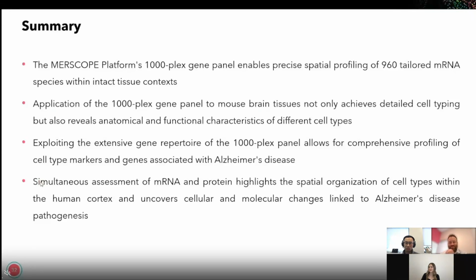Great, thanks, Peter. All right, next question. If you include cell bounds in all aux channels, what are you seeing the maximum runtime being with the 1000 plex? Yeah, so I can take that one as well. Maximum runtime, if we max out all of those settings, is approaching 65 hours. That's maximum tissue area, cell boundary stain in all of the auxiliary channels, so you're getting a lot of information there. So it approaches 65 hours, but nothing absolutely crazy there.